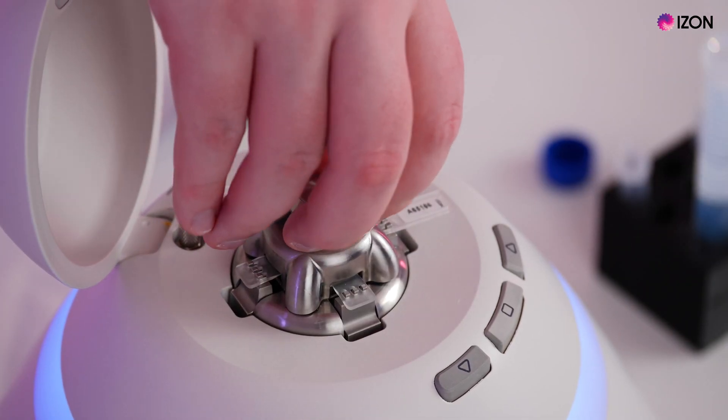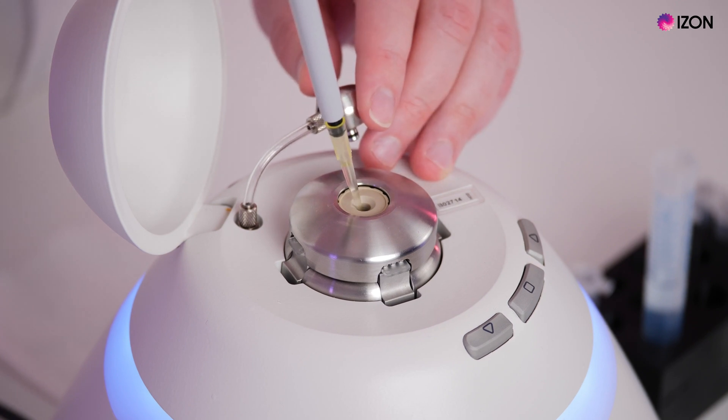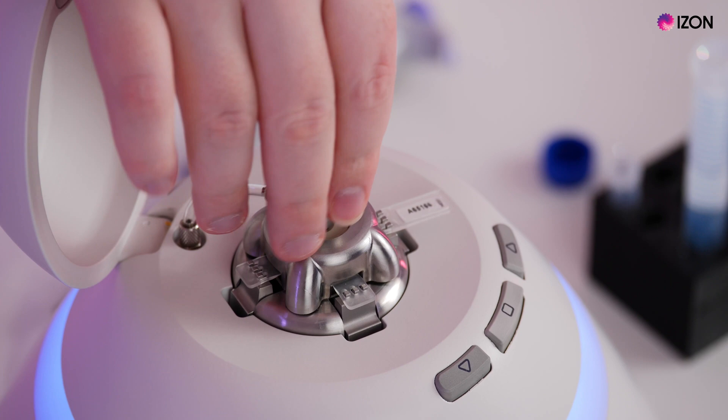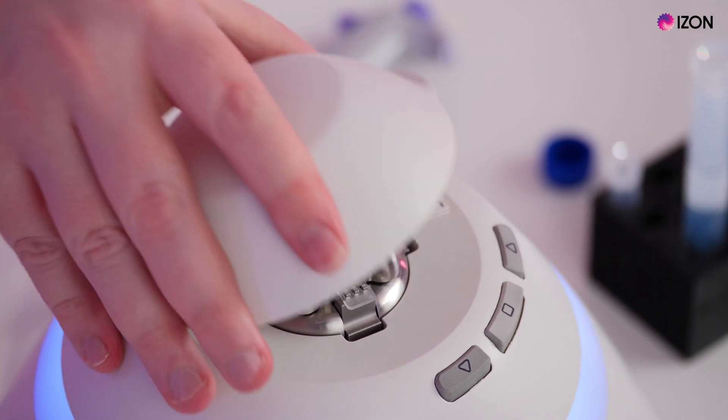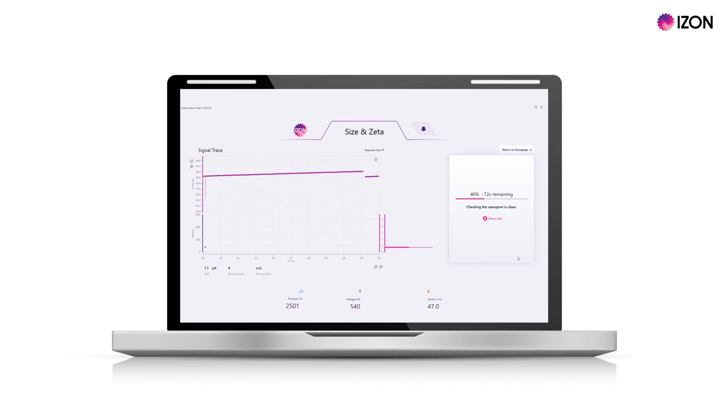You will be prompted to clean the nanopore by reverse pipetting three times. Then replace the fluid with 35 microlitres of fresh measurement electrolyte. Insert the pressure nozzle, close the lid and select OK. Wait for the cleaning process to complete and click OK to continue.